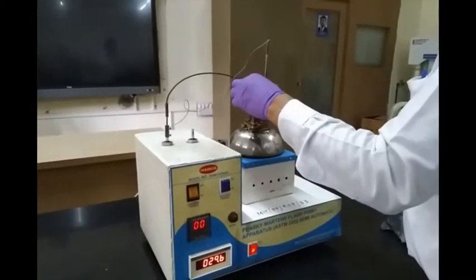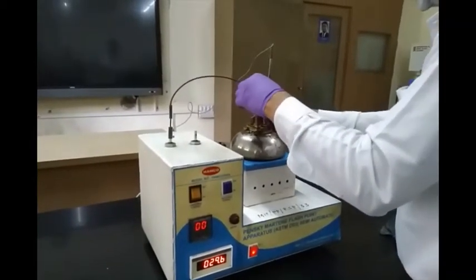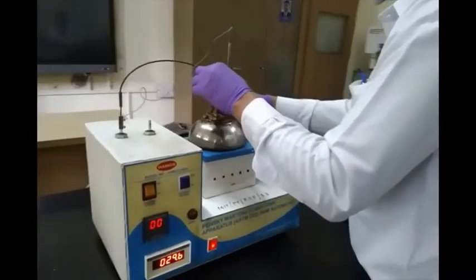Then it is sealed tight so that there is no vapor leakage. We have to double check that there is no vapor leakage, otherwise we won't be getting the flashpoint accurately. Now our apparatus is ready for experimentation.